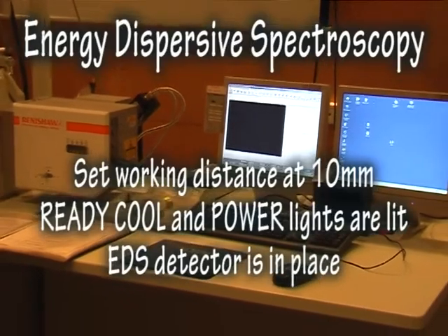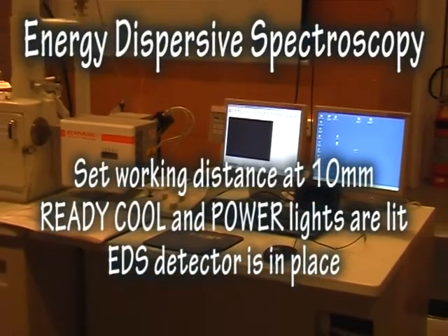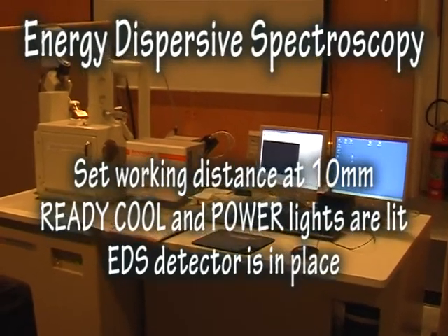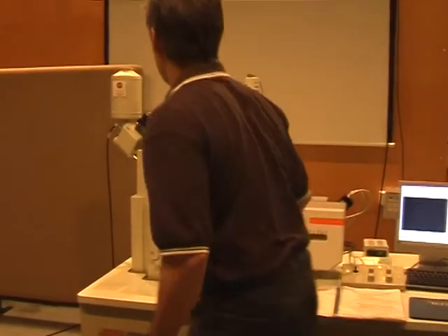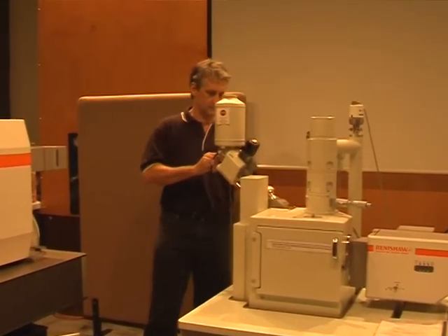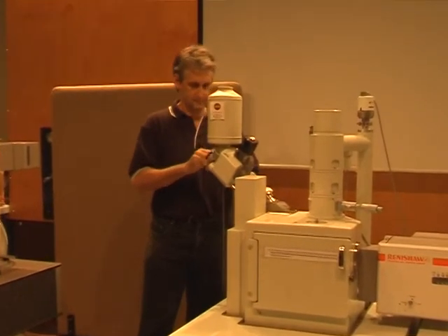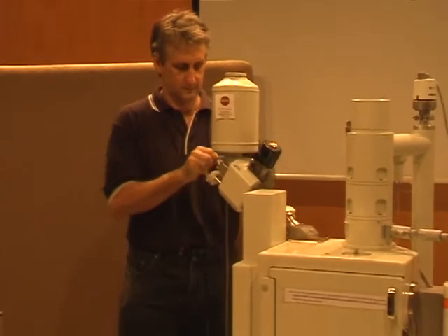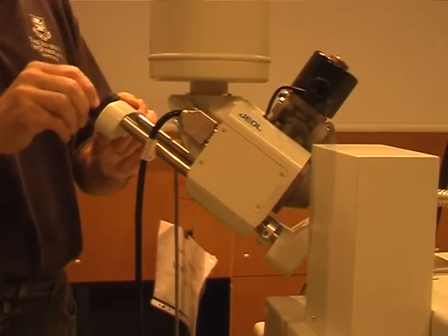For routine EDS analysis, make sure the ready-cool and power lights are lit on the desktop EDS control box panel. Wind in the EDS detector anti-clockwise until a gentle click is felt to indicate that the detector is in place. Set the working distance at 10 mm for EDS.